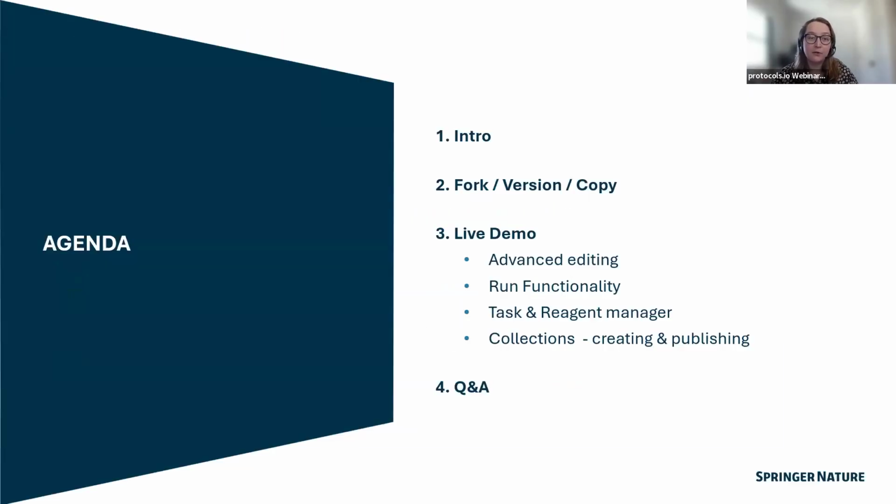For today, we'll go through an introduction about protocols.io, fork versions and copies, the terminology of those different features on the platform. I'll walk you through a live demo, also covering several advanced editing, run functionalities, task and reagent manager, and collections. And then we'll have a lot of time for Q&A. So if you have any questions or anything I didn't address, we can go through that.